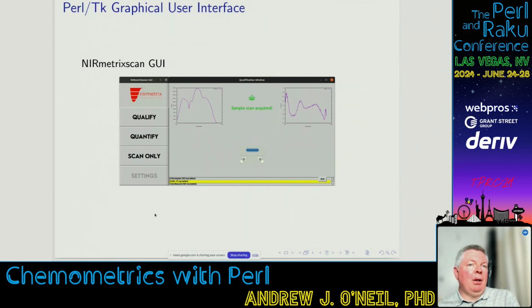That can change in a room or a lab quite quickly over a few minutes or an hour or so, and that will change the sensitivity of the device, because moisture in the air absorbs, etc.